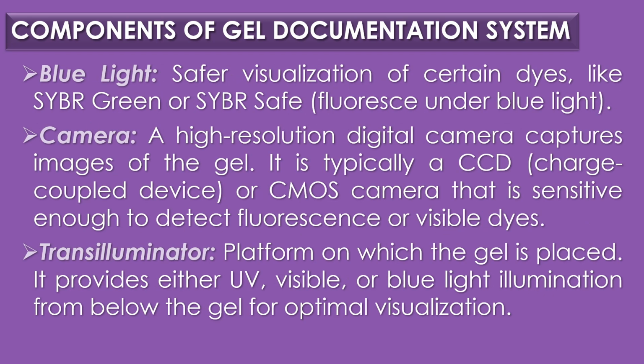The third component of gel documentation system is blue light. Blue light is used for safer visualization of certain dyes like SYBR green or SYBR safe, which fluoresces under blue light.